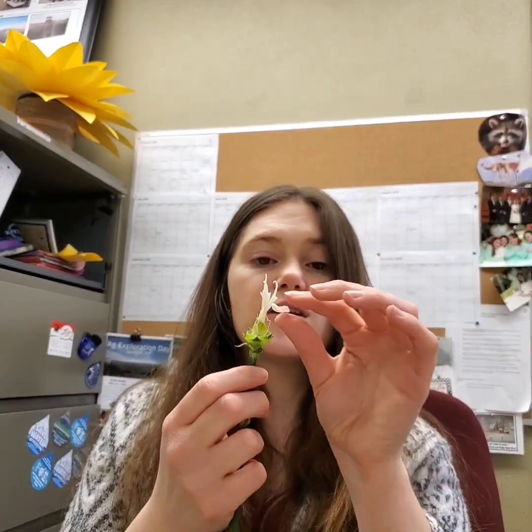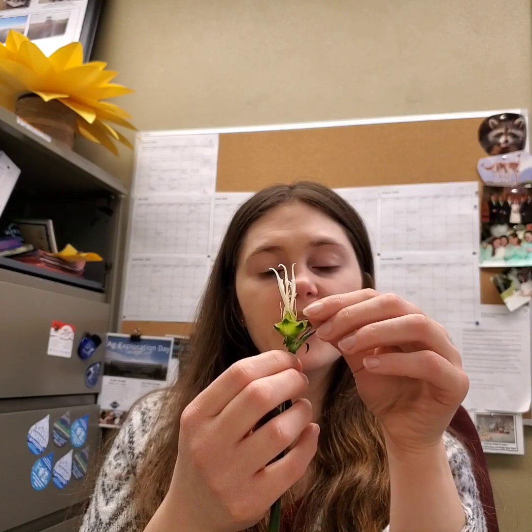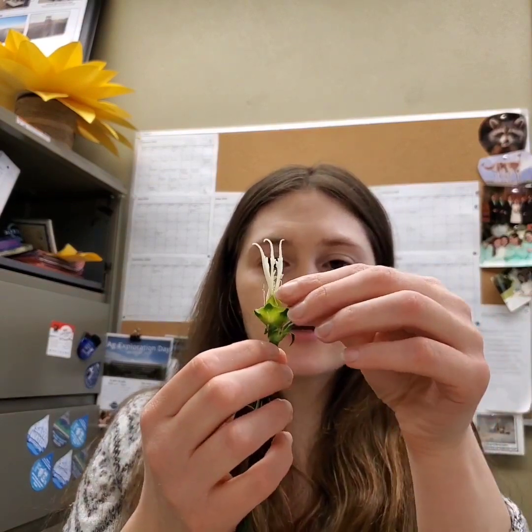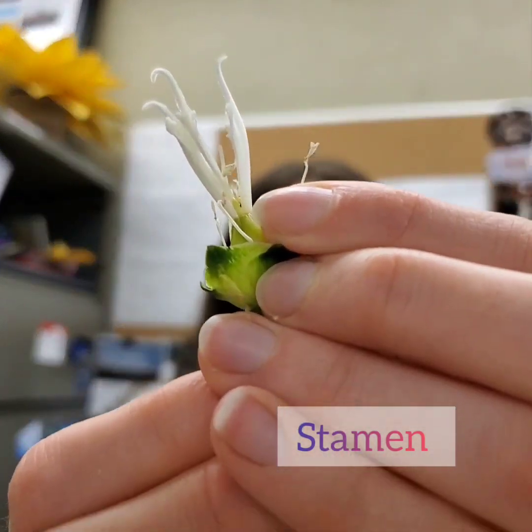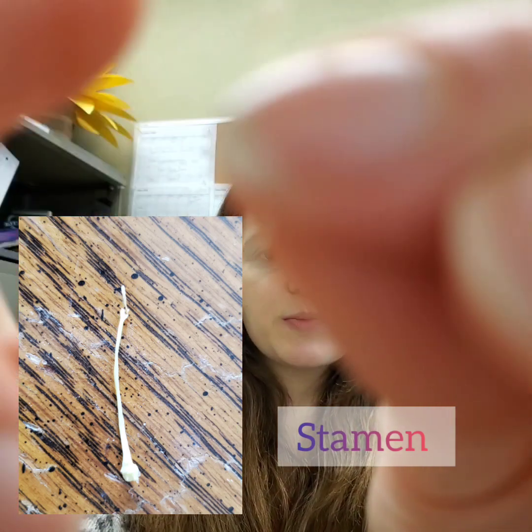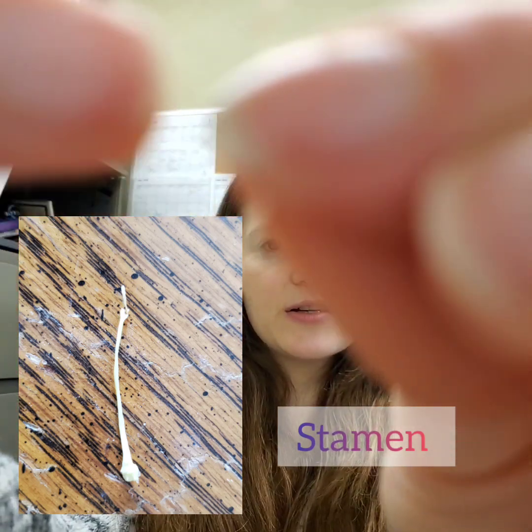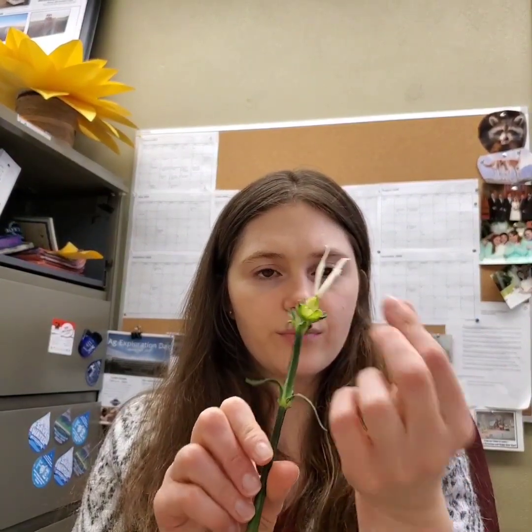Alright, so now there are no sepals and there are no petals. We are left with the male and female reproductive structures. Here's the stamen. You can see it just barely, it's very small. This is the anther where the pollen is produced, and here's the filament. Alright, so now we're going to remove all of those as well.